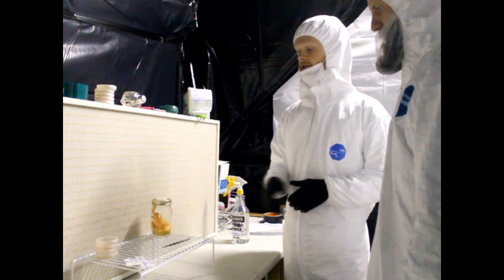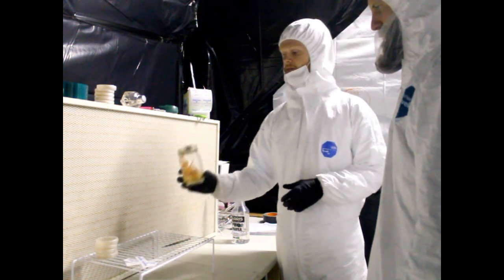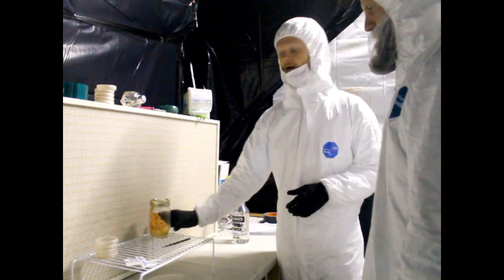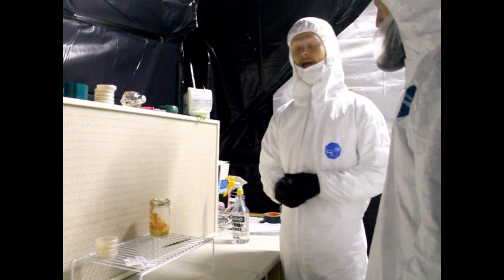We'll get this culture, grow it out, and once we grow it out we'll take a spore print. So we're getting new genetics, new seeds — we're seed saving for mushrooms.